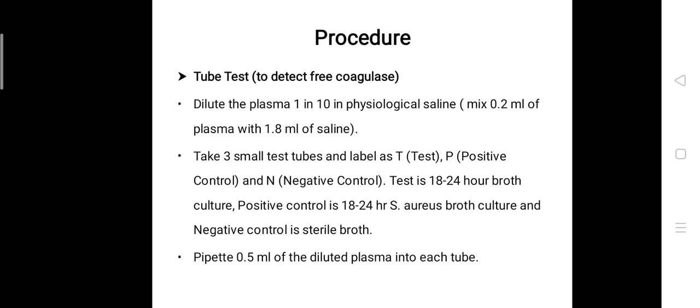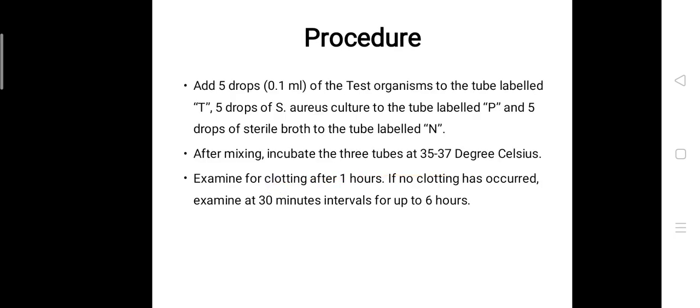Pipette 0.5 ml of the diluted plasma into each tube. Add five drops of the test organism to the tube labeled T, five drops of Staphylococcus aureus culture to the tube labeled P, and five drops of sterile broth to the tube labeled N.